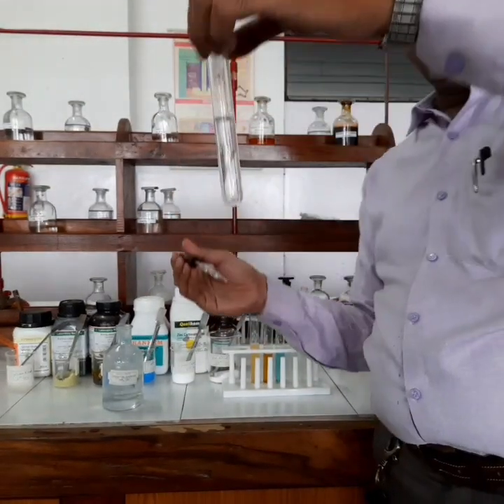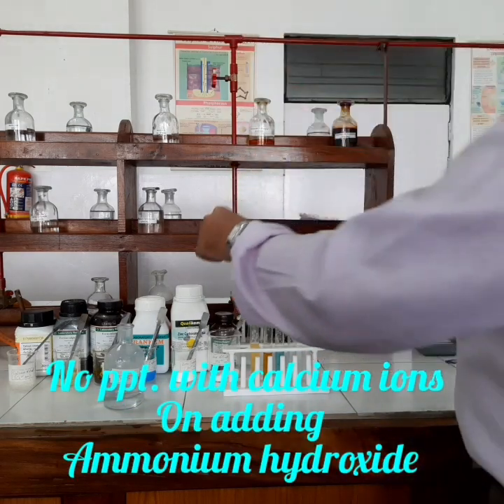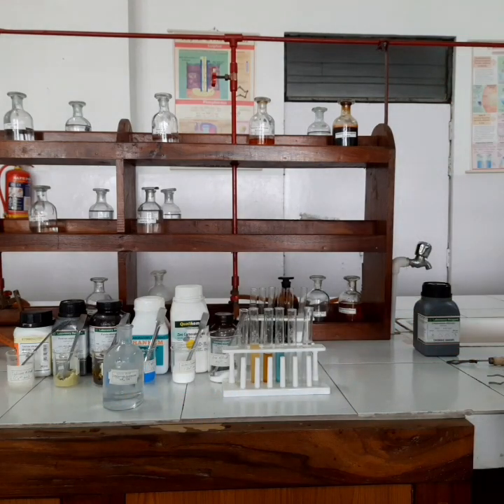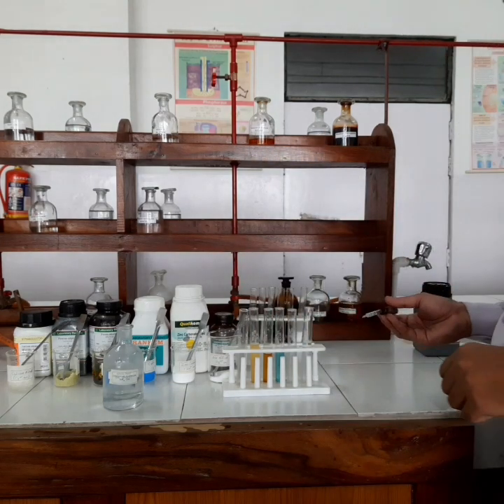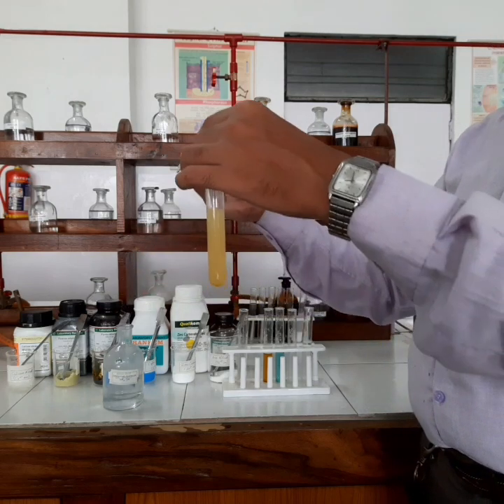As you can see, I have added ammonium hydroxide to calcium salt, and I am not getting any precipitate of calcium hydroxide because ammonium hydroxide is a weak base and it provides a very low concentration of OH minus ions. So calcium ions are not going to get precipitated. So this is the first difference between the precipitates formed by NaOH and NH4OH. Now secondly, I am going to add ammonium hydroxide to the ferrous salt.